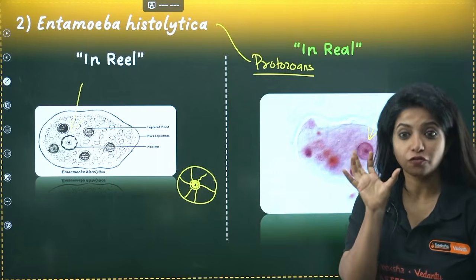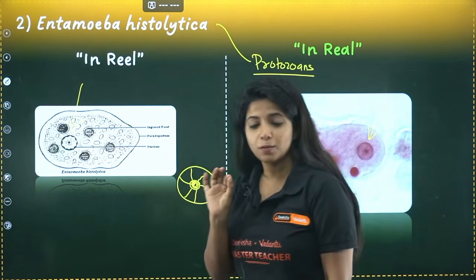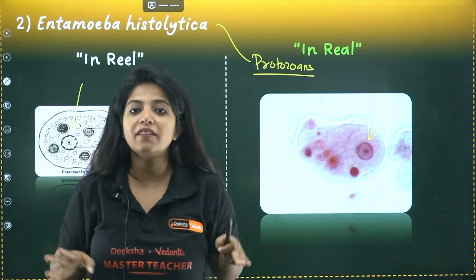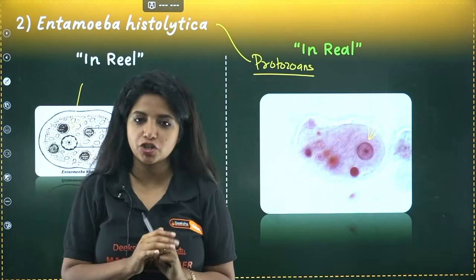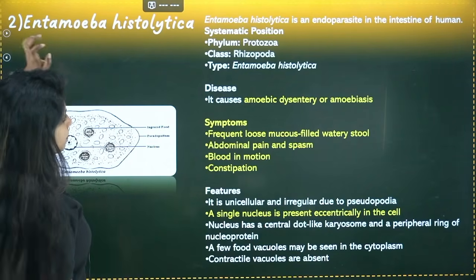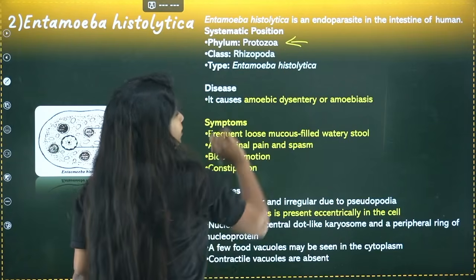The identification factor that you can easily get to see is this. And also remember one very important thing, they have a very irregular shape. So it's not like they will have a proper shape out there. They might have an irregular shape because, my dear children, they're amoeba. They have pseudopodia. They can change up their shapes out there. Okay, so this is something that can be easily identified. Look out for this. So Entamoeba histolytica, as I told you, they come under protozoans, and yes.